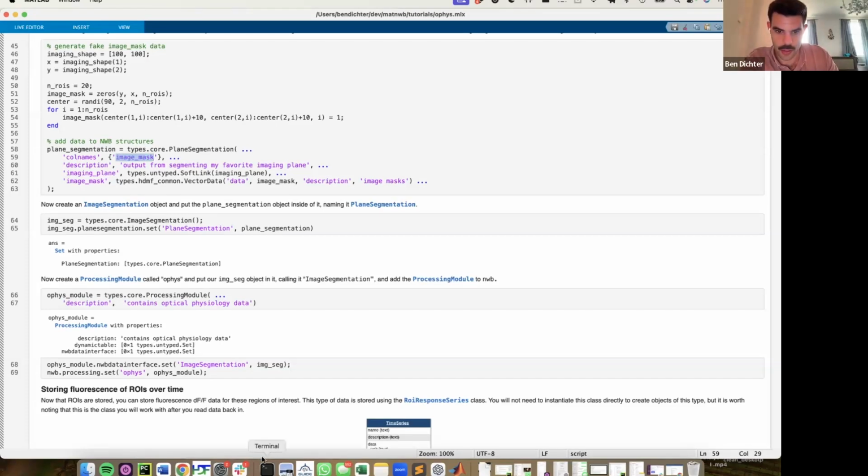Oh, I see a question. Can I use a single mask with, oh yeah, sorry. Yeah, we already answered that. Okay.